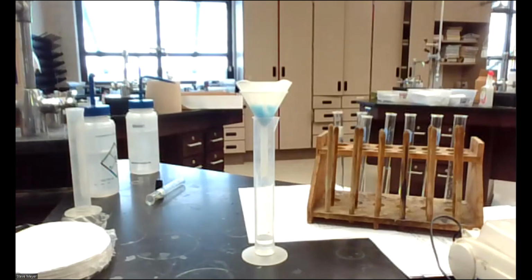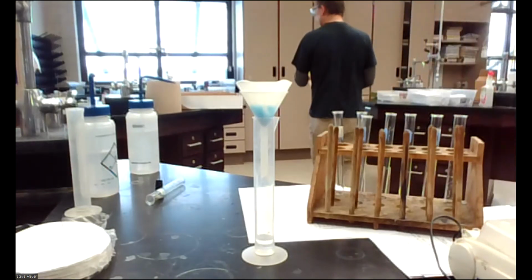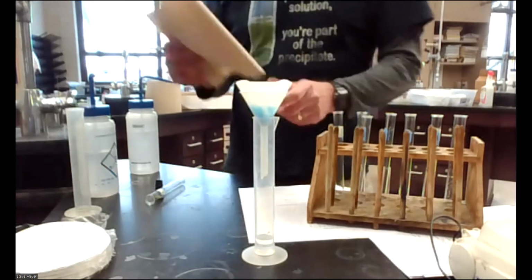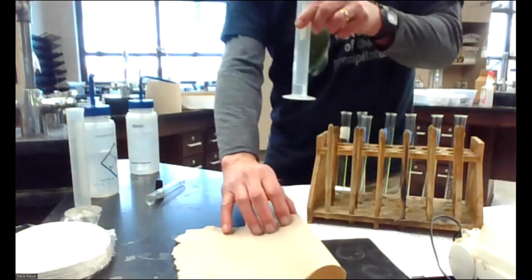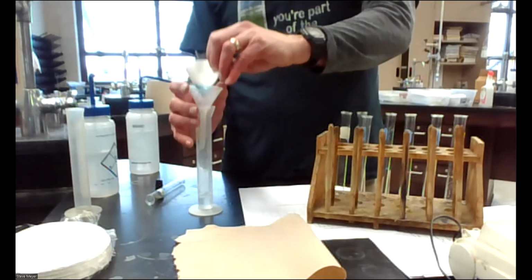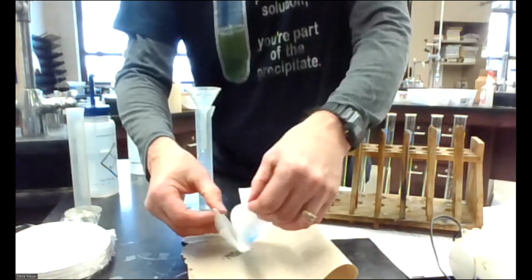And I'll probably have a tray for your team actually. It's labeled. Find one, and then you can call this on the paper towel test tube 1 and team whatever, period whatever. And I'm going to just take this out, put this out here. We'll leave it out to dry.